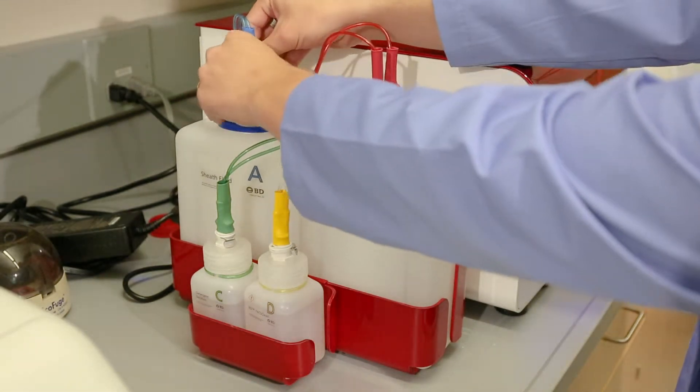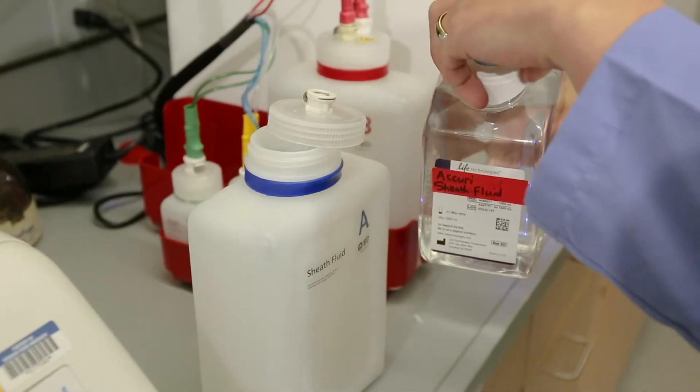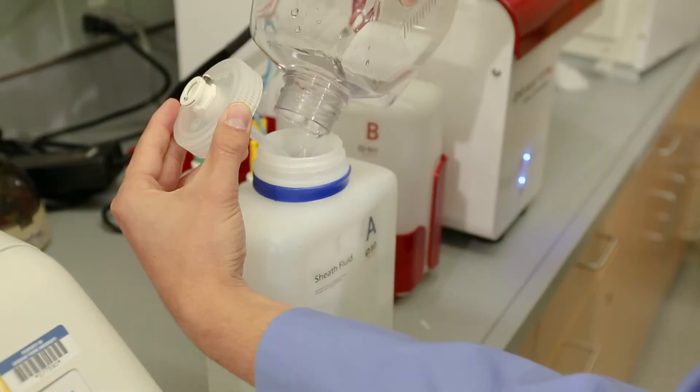Unclip all attachments on the top of the sheath tank and the waste tank. Fill the sheath tank with 1X sheath fluid. The container should be on the tall shelf on the north side of the bay window.